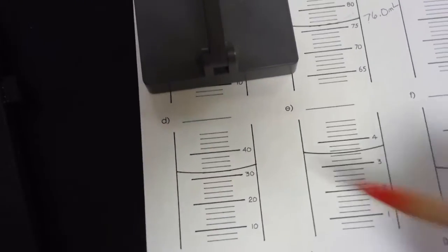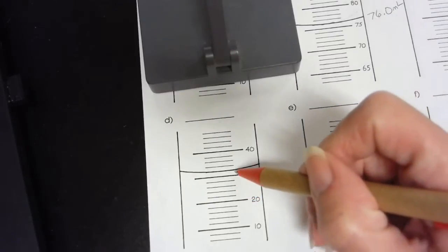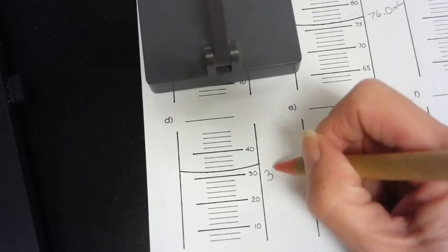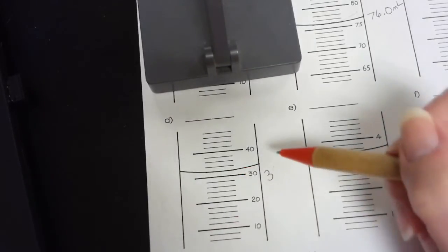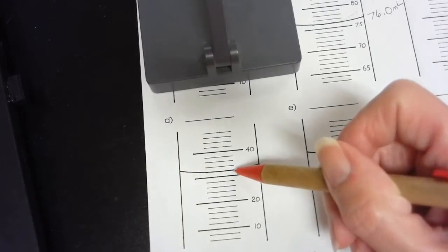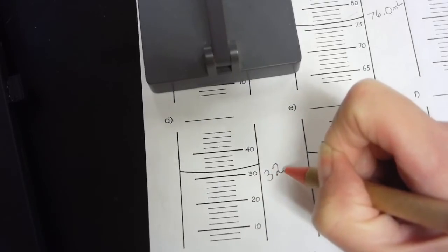Okay, now this one, we've got 20, again, 2, 4, 6, 8, 30. All right, so this looks to me to be exactly right there on the 32 mark. All right, so I'm going to say 32.